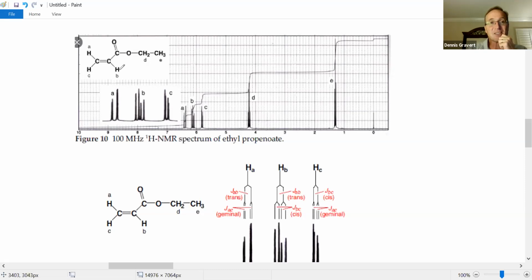So who's closest? Well, I would have thought B was the closest. But it turns out hydrogen A is the farthest downfield. So here's 0, where TMS is, the most shielded molecule. It's way upfield. And as you get close to oxygen, you should be shifting downfield. Well, it turns out A is closer through space. If you measure it, they're closer. Although I would argue that B would have been closer. But hey, I don't make the rules. Nature does. And wait, it's being split into a doublet.